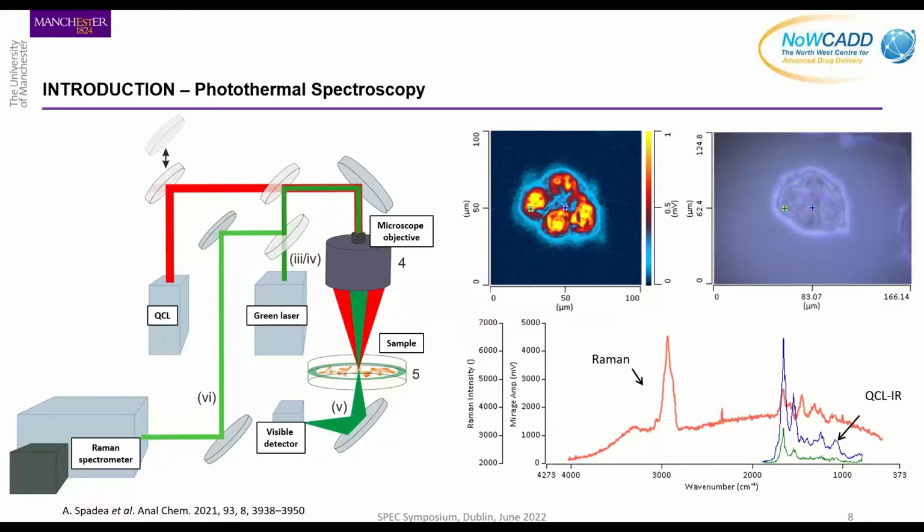So we've got the system with the Raman spectrometer, and you can see now beautifully the complementarity of these techniques, in that we've got really good information from the CH stretching region, but the Amide I and Amide II is quite low intensity in Raman, whereas of course it's high in the infrared. But we're also lucky enough to have the OPO system as well.